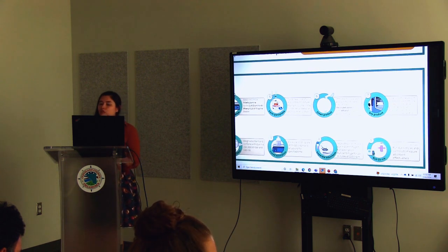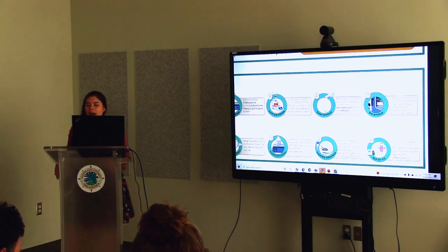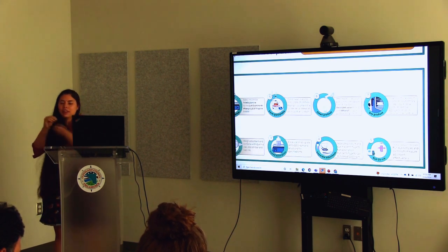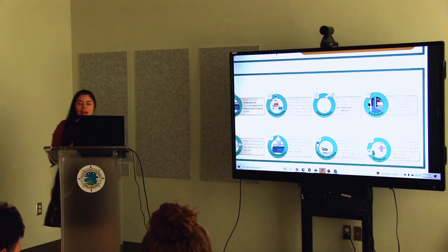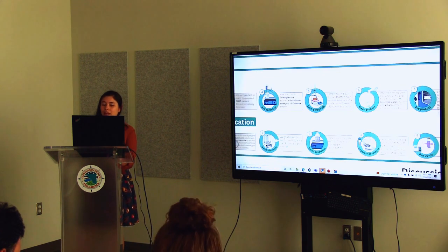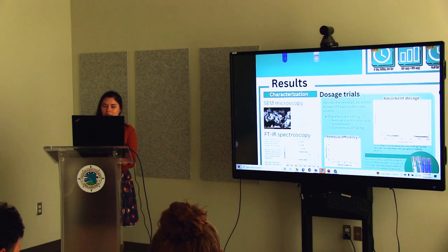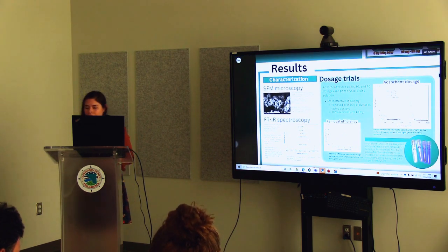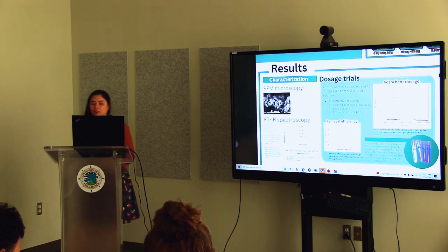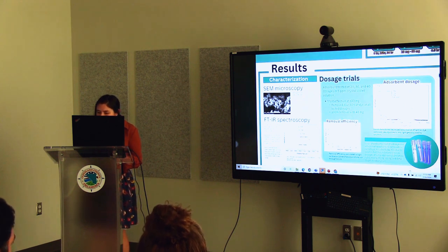And then we're going to dry it out in a vacuum oven for at least 8 hours. Then we're going to crush it up after we get it out of that oven to make sure that we don't have any aggregates. And then we need to make sure that we made the right thing with FTIR. So we're going to skip down here to characterization. Before we go through all the trouble of testing it, we want to make sure we actually made the right thing.